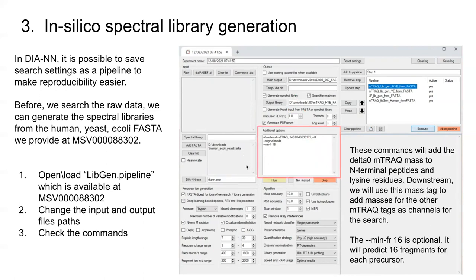Once you do all three of those things, you'll want to add these commands into the command line. The first one is a fixed mod. Basically you're saying that you're going to add this fixed modification mTReK, which has a mass of 140 Daltons and change. Because it's amine-reactive, it's going to label N-termini and lysines. This other command, minfr, tells it to predict 16 fragments.